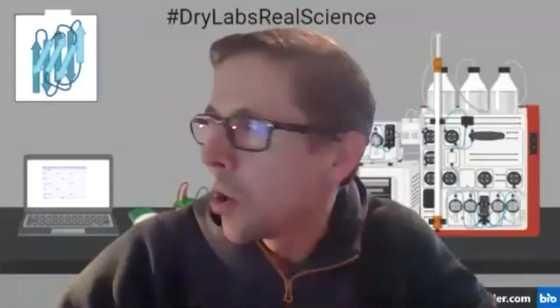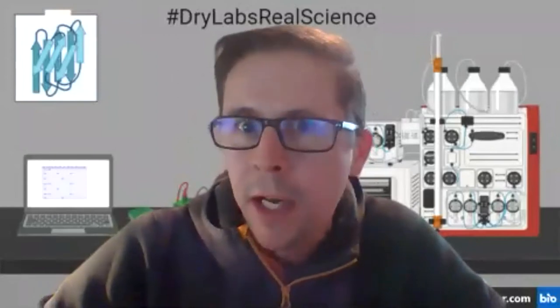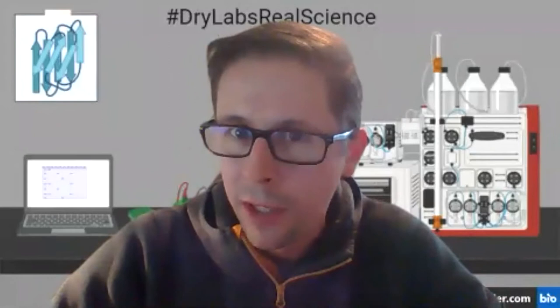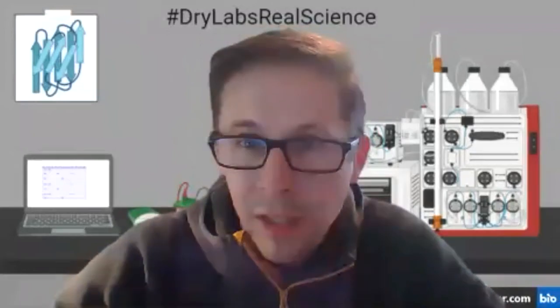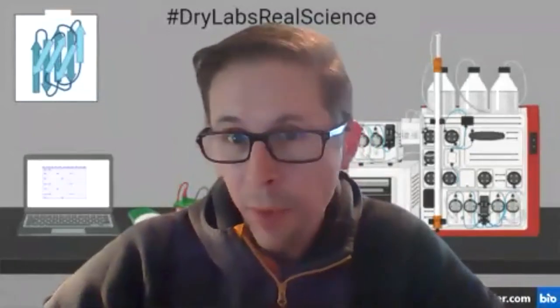I came across Bob's resources on an HPLC simulator lab. He'd written a really nice command prompt system to help his students work through the simulation. I thought it'd be really good to invite Bob along to share what he's been doing, because I found it of great value and have used it as the base for my dry lab provision. So I will hand over to Bob, if that's okay.